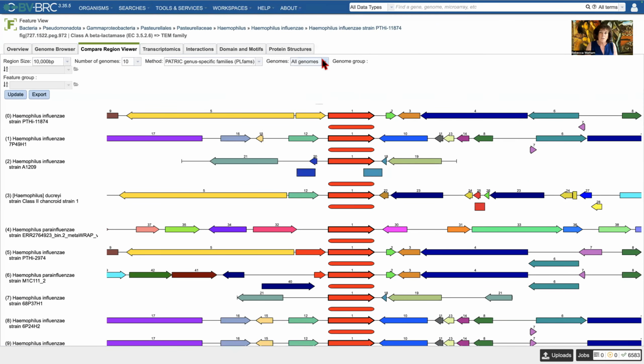In the last video, we talked about all the filters, including looking at the reference and representative genomes, which is the default, and then all the public genomes and how it does BLAST against those genomes to find the gene of reference. And then it brings in the upstream and downstream genes, and you look at those. Recently, we updated the viewer so you could view your genomes, your data of interest, in this viewer. So in this video, I'm going to show you how to do that.